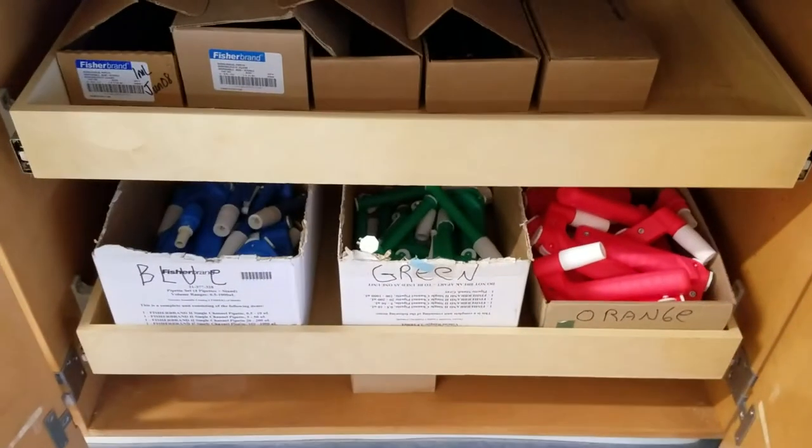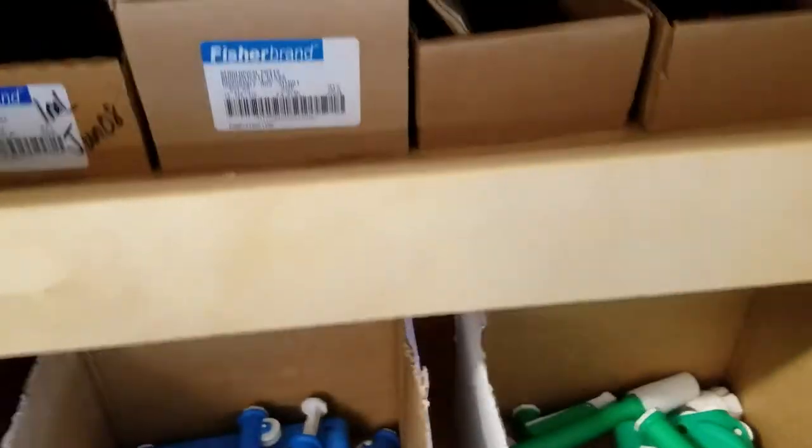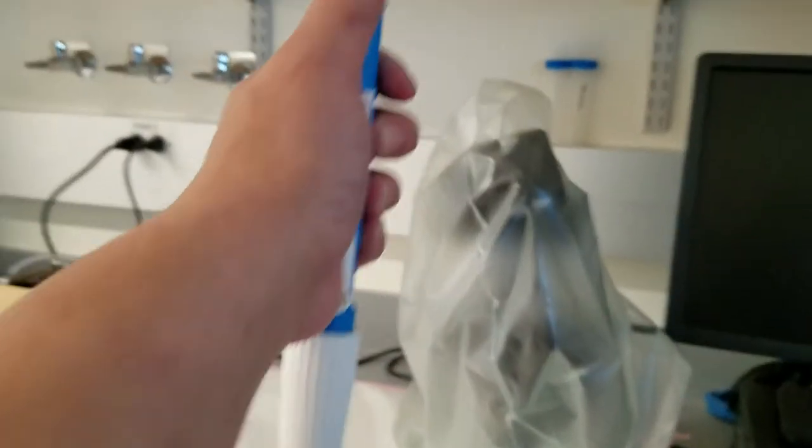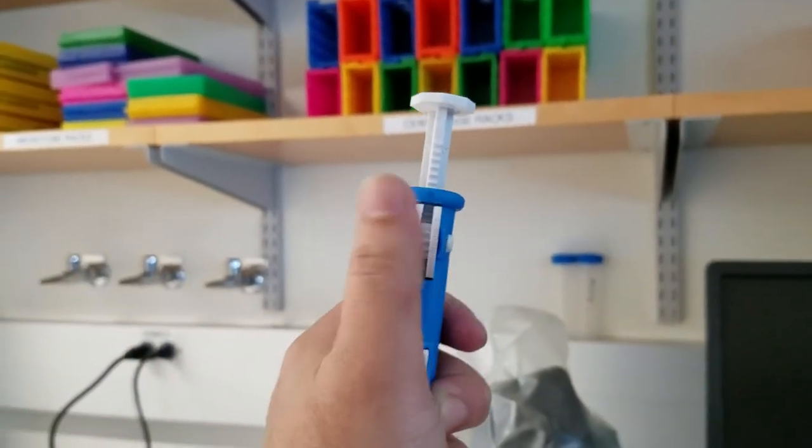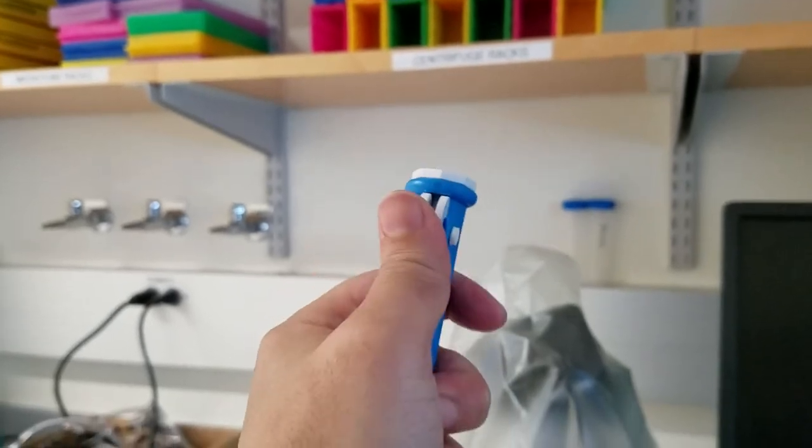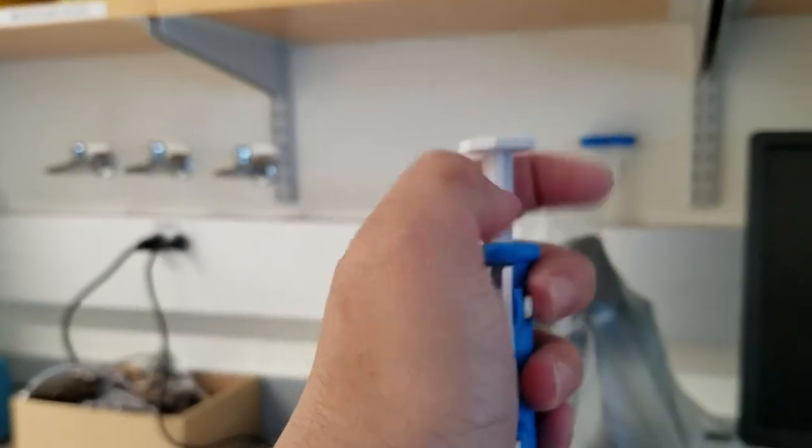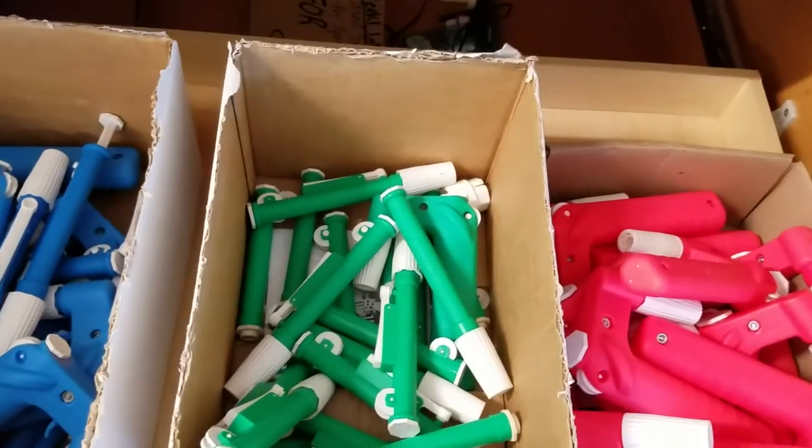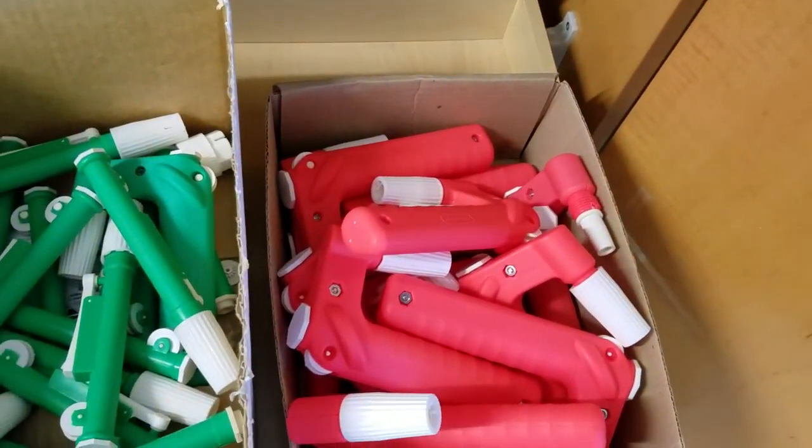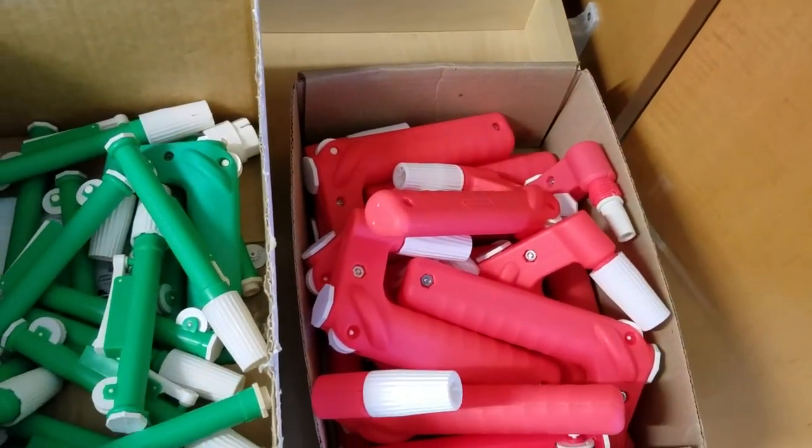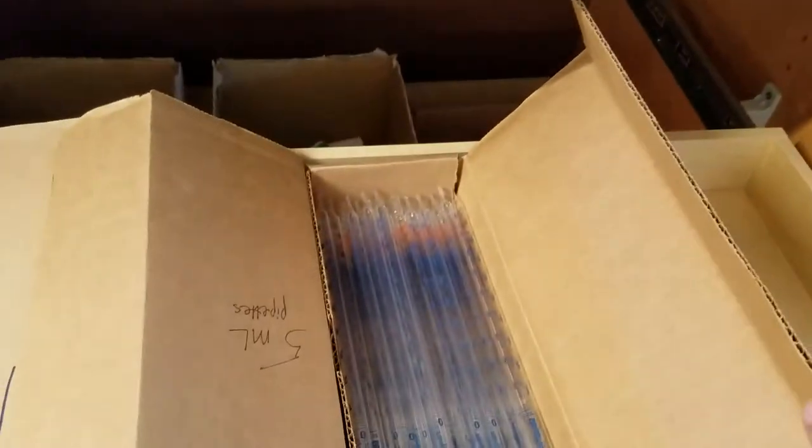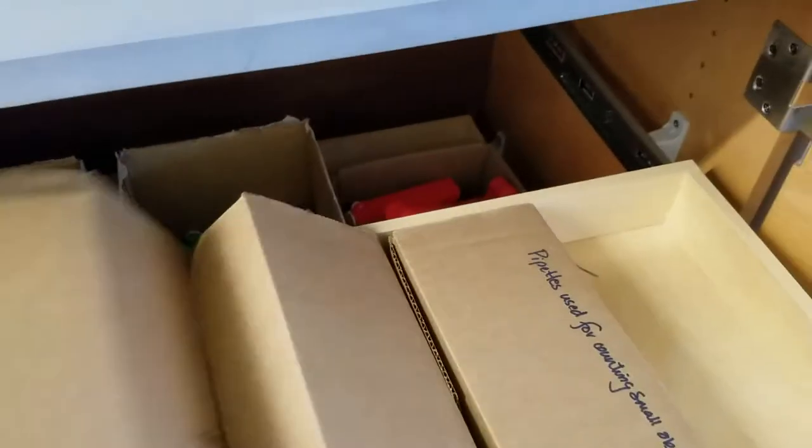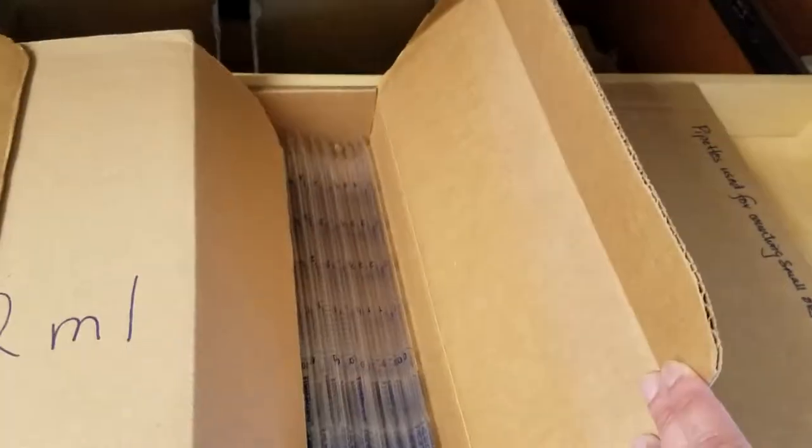Finally, for larger volumes that we need to pipette, we have serological pipette pumps and serological pipettes that they can use. The blue ones go up to 2 ml - we lift up the volume by going up, we release it by bringing it down. The green ones go up to 10 ml, and for larger than 10 ml we use these neon pink colored pipette pumps. If we are not using aseptic technique we use these glass pipettes, glass serological pipettes that come in various sizes - we have them from 1 ml, 2 ml, 5 ml, and 10 ml. For aseptic needs we have special plastic pipettes that are individually wrapped that we use.